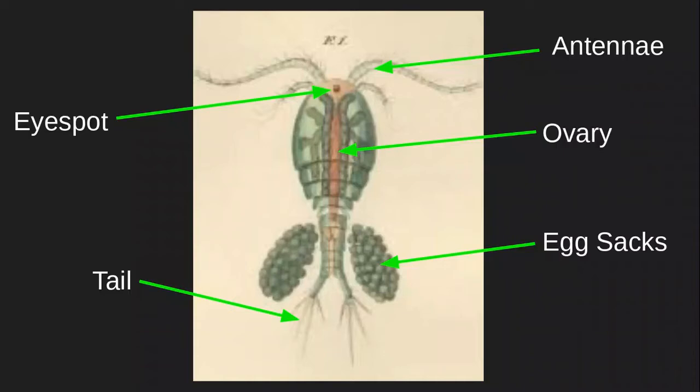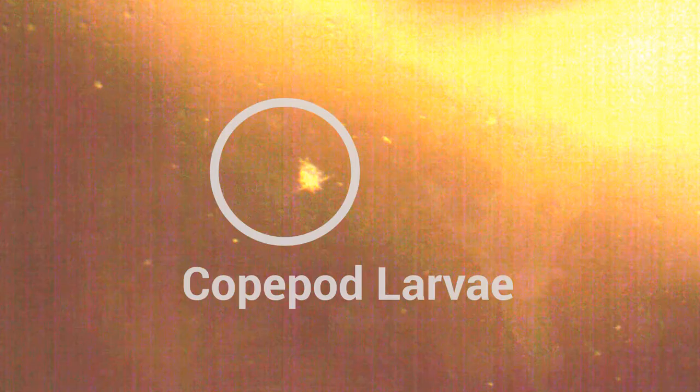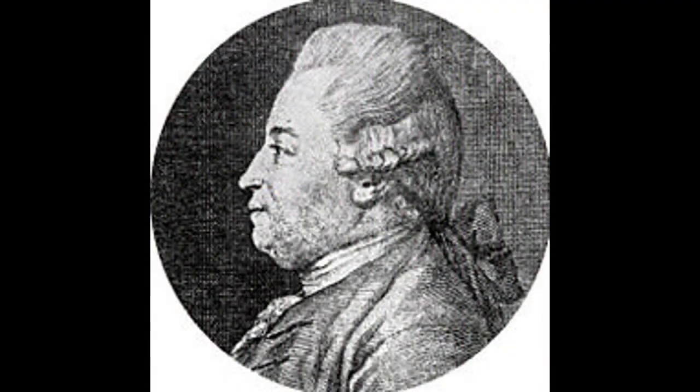The females carry egg sacs that hold their young, and which eventually hatch into nauplius larvae. The larvae look nothing like their adult stages, but molt their skins as they mature. They're so different when young that the scientist who discovered copepod larvae, Otto Frederick Muller, actually thought they were a different species, as did I when I first laid eyes on them.